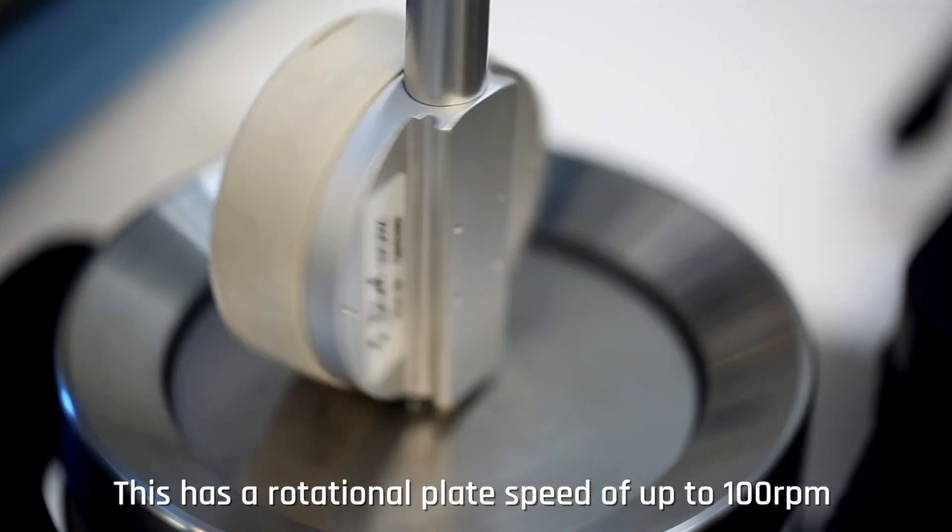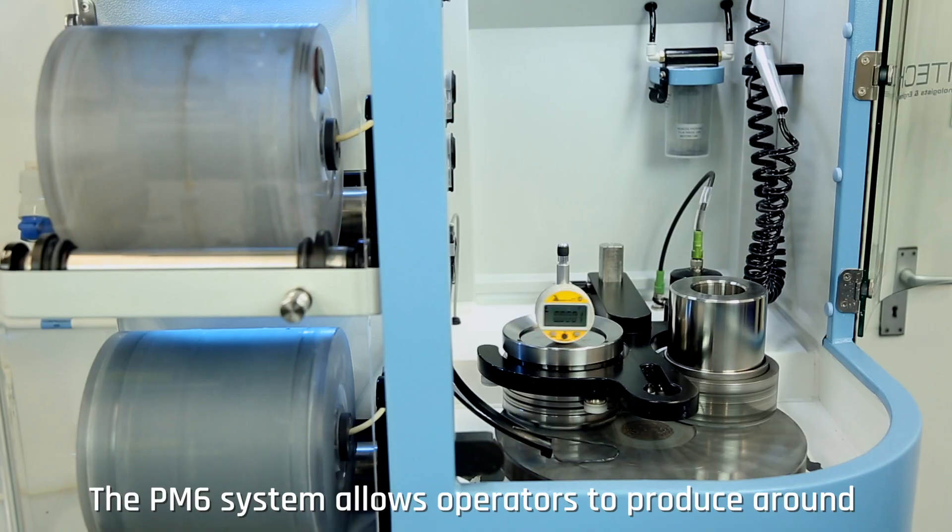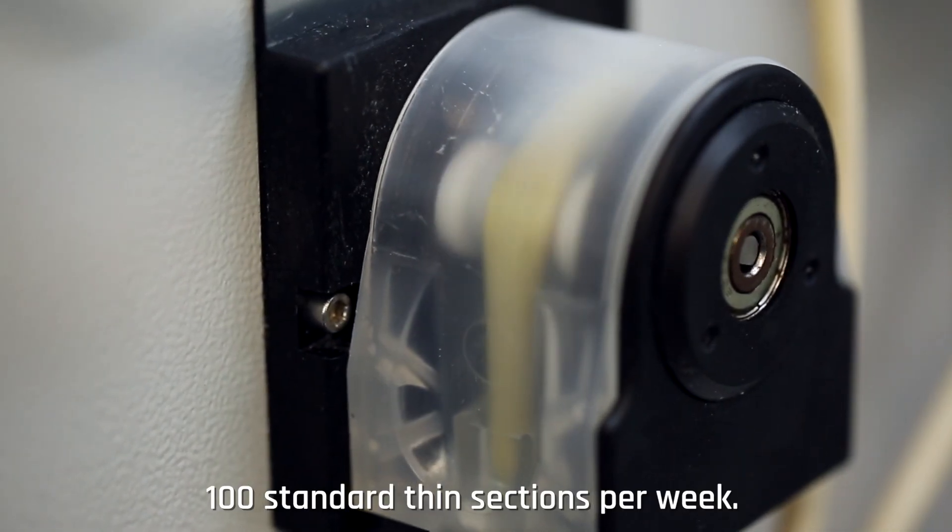This has a rotational plate speed of up to 100 RPM with the aid of an abrasive slurry. The PM6 system allows operators to produce around 100 standard thin sections per week.